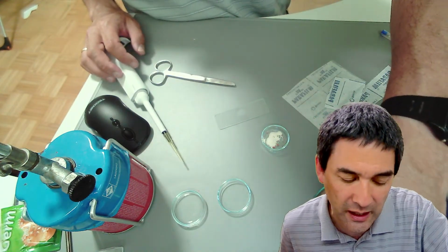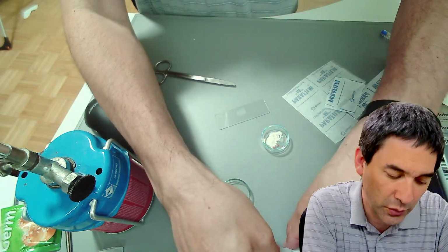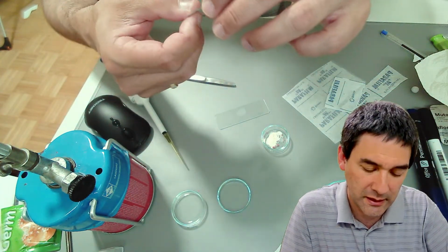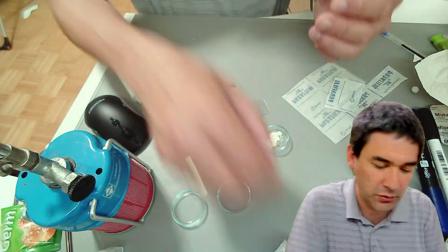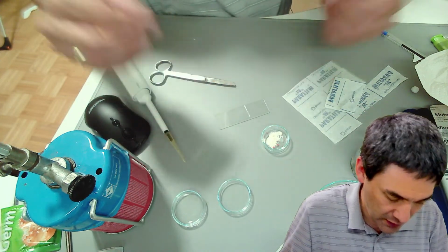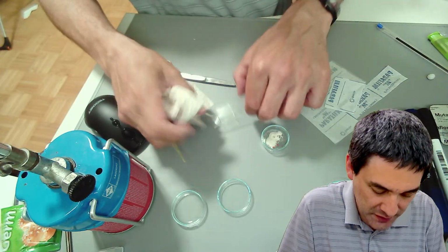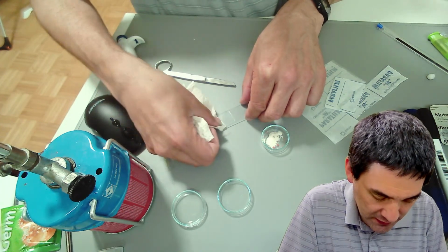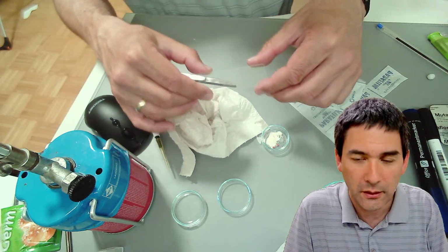I assume that there are going to be a lot of clusters. So I don't think that it will look quite as nicely as the other one, but who knows? I always have to check. There were two cover glasses. So let's have a look. Okay. I might remove a little bit the excess water from the side here to make sure it's really flat, and so that the bacteria are not able to move too vertically. And let's have a look.